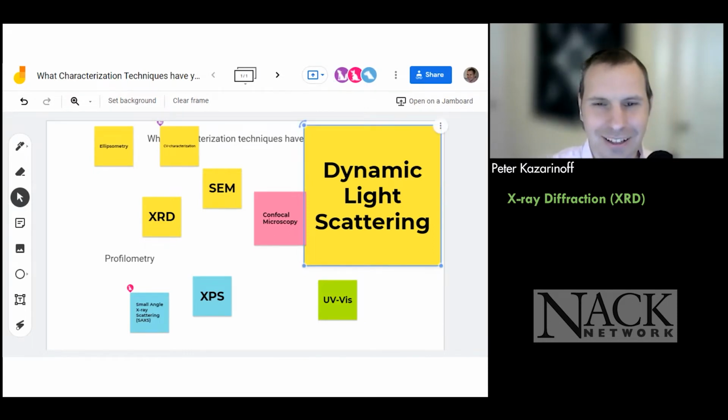We were synthesizing nanoparticles with the students, and we were looking at the size distributions. It's another light-based characterization method that interacts with the nanoparticles, and it's a very detailed analysis that can give you a very accurate distribution of the nanoparticle size. So it can tell you that you have 35 nanometers and also 70 nanometers at the same time.